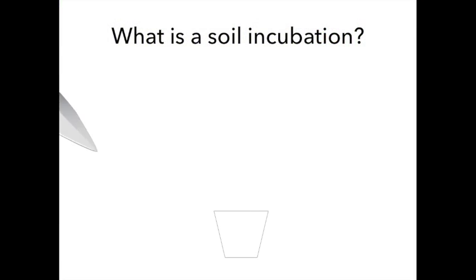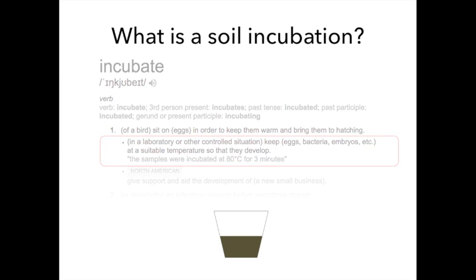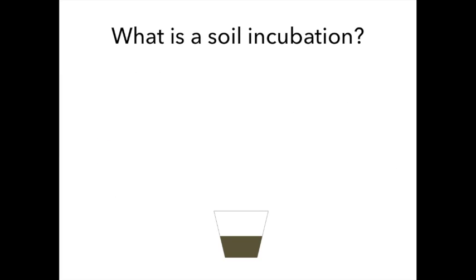What is a soil incubation? The term incubation refers to the fact that soils are generally kept at a constant temperature in a controlled environment. Soil incubations in the lab offer a convenient and controlled way to test the effects of variables such as moisture or temperature on soil processes. Changes in the soil are measured over time.